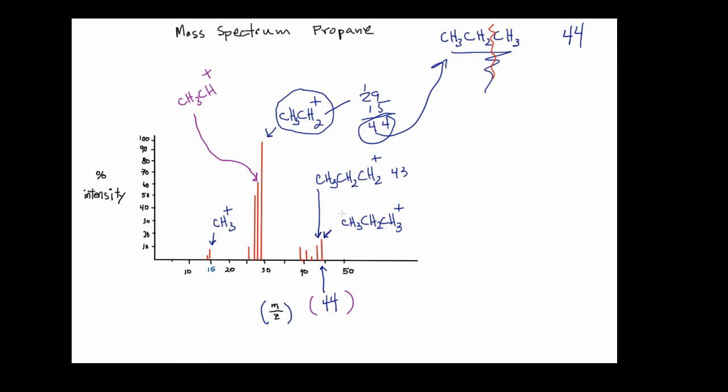That's the way that you can line up the answers they've given you to what the scan represents. And then finally, before I close, the one thing I want to tell you about this is that in real life, what you're doing quite often as a chemist is introducing a mixture of molecules for which you're dealing with an unknown. And so you're going to go to your largest molecular ion peak to gain information about a possible molar mass of the molecule that perhaps you produced in an organic chemical reaction in the laboratory.